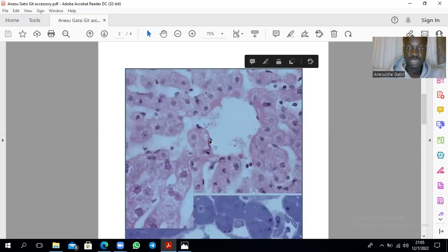Those are the endothelial cells that I mentioned, right? Then these are your sinusoids. That's a sinusoid. There's an example of a Kupffer cell in the sinusoid. Remember, these are hepatocytes. That's a Kupffer cell. Then that's another sinusoid. That's another example of a Kupffer cell inside the sinusoid. All these are sinusoids. Those are Kupffer cells inside the sinusoids.